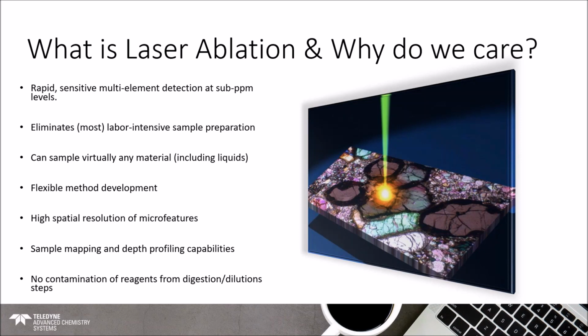But at the end of the day, the sample prep is normally quite a bit quicker than it would be through dissolution. All we really need to worry about is making sure that we have a flat surface and that it is perpendicular to the beam coming down. How we mount it and whatnot, of course, comes into it as well. But like I say, in most cases, the sample prep is minimal in comparison.